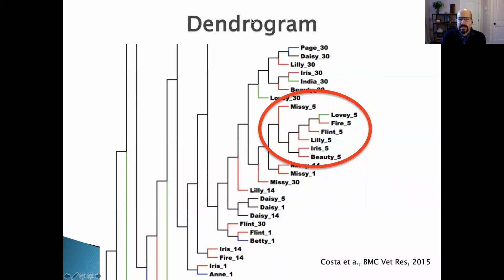Okay, so the first thing I want to say, like you just answered me, is that membership takes into account only who is there, which type of bacteria. And like Laura said, the structure PCoA or the structure dendrogram will also take into consideration the relative abundance.